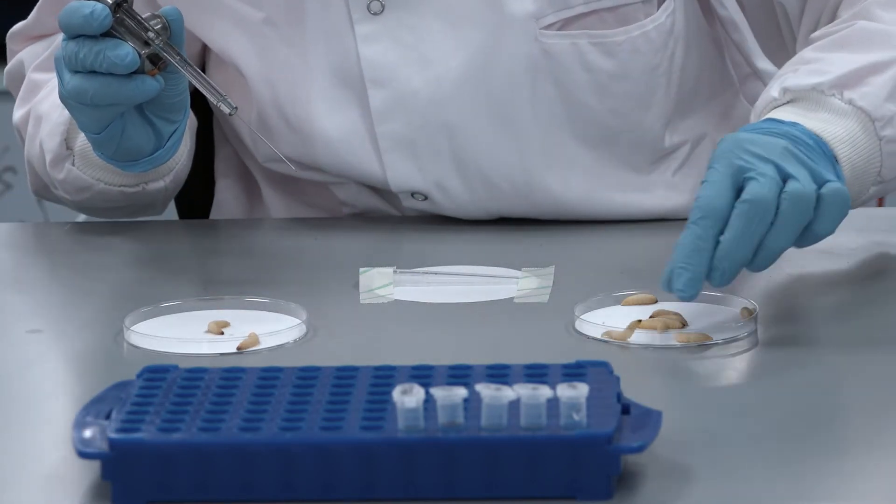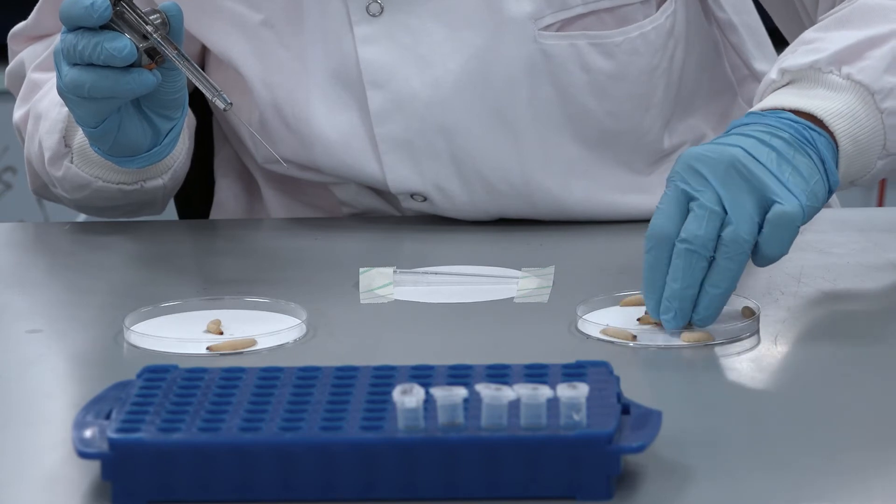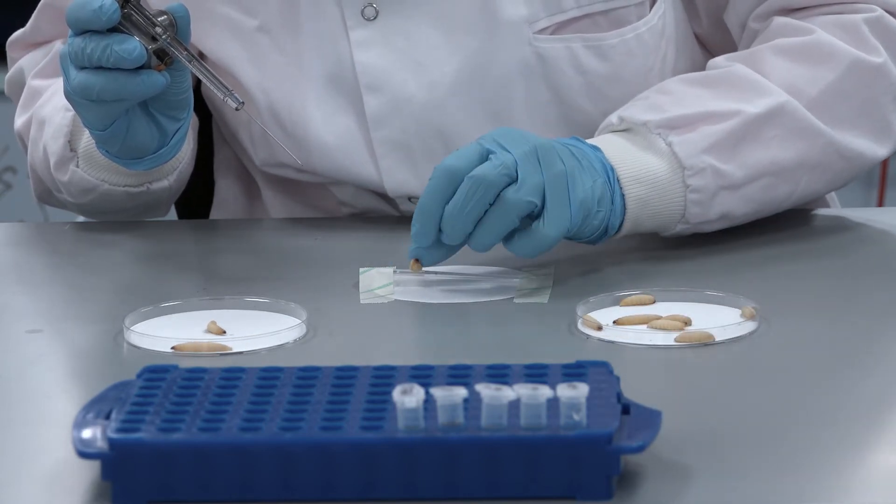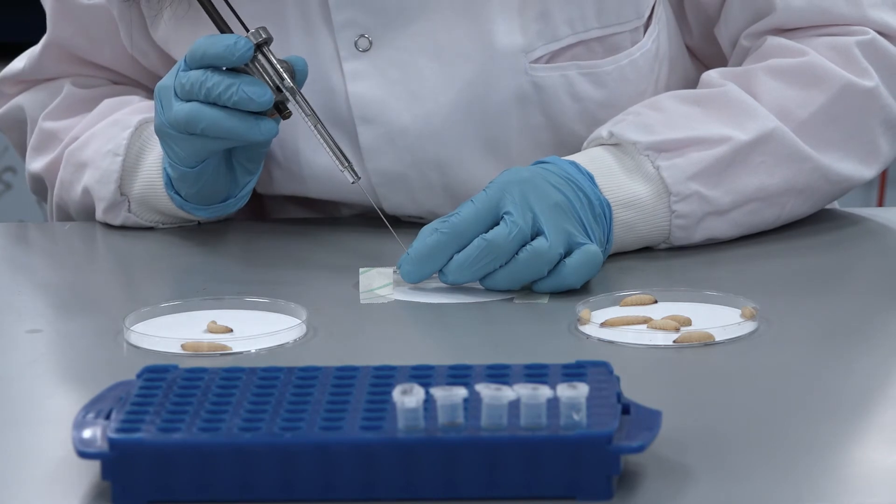Remember for the strain that you are working with, the dilution series required to calculate the LD50 may vary and this will take some optimization.